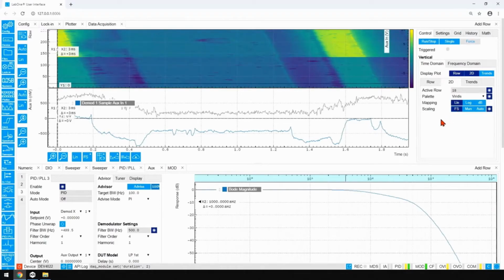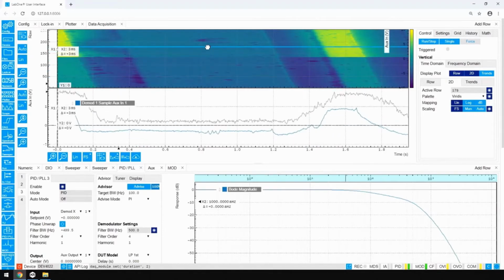So here we go. Here you see that you have the 2 traces over the same image. We can actually look at them over a different line in the image. What is important to notice is that in this upper area, we had 1 volt applied to the gold electrode, the aluminum electrode being on ground on the sample, and in this lower part, there was no voltage applied.